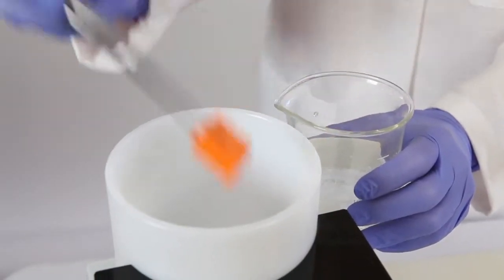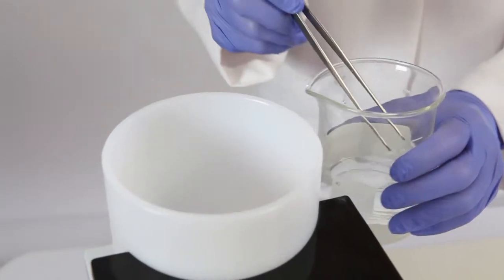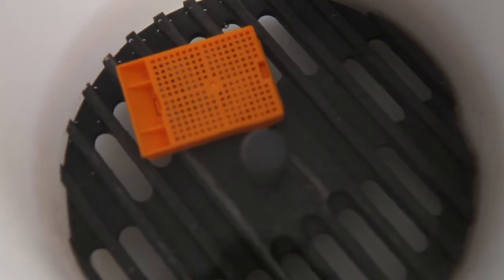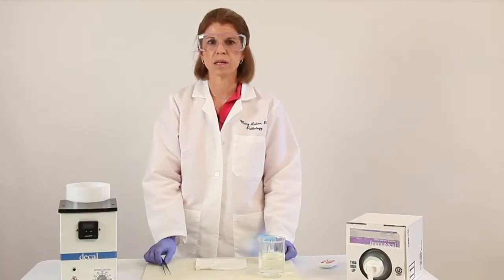So now I'm going to put the specimen into ImmunoCal. I use a magnetic stirrer with a bar that constantly spins. It keeps the solution moving, so more ions make contact with the specimen, which speeds up the process.